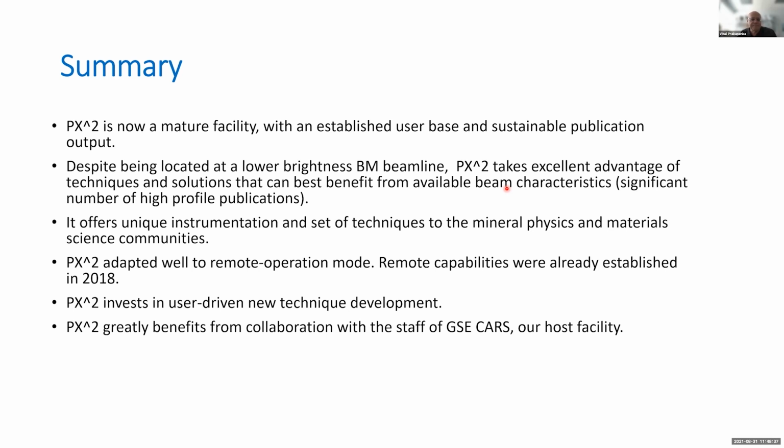Okay, thanks. That's great. We have a question from Claire. If you could unmute yourself. Hi, thank you. I think that you might have already begun to touch on it with Vitaly's question, but I was curious about the beam size and the flux when recrystallizing samples at high temperatures. So if that's something that'll benefit from the upgrade, if you could elaborate more.